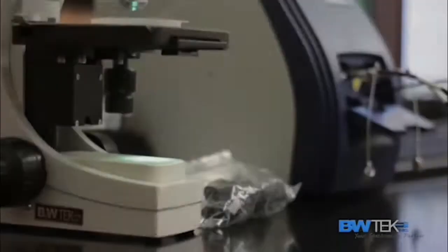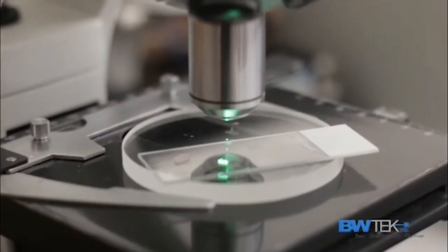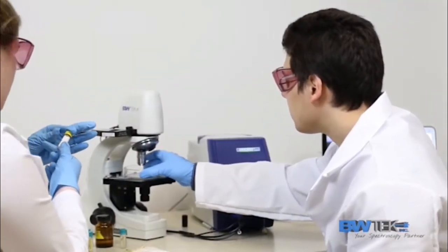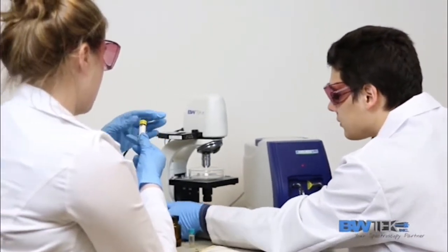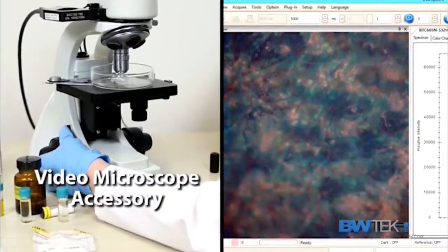For the highest level of flexibility in facilitating Raman sampling for a variety of applications, we recommend our video micro sampling system. Its integrated camera allows for precision Raman sampling through camera monitoring of the laser beam and imaging details.